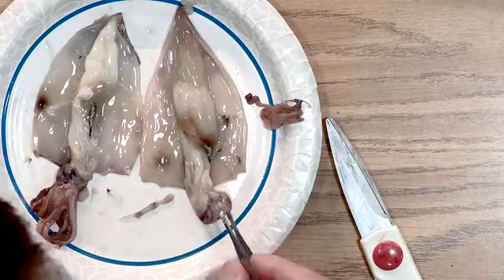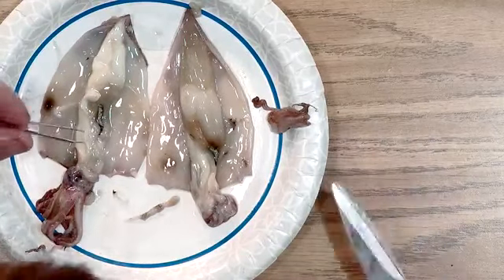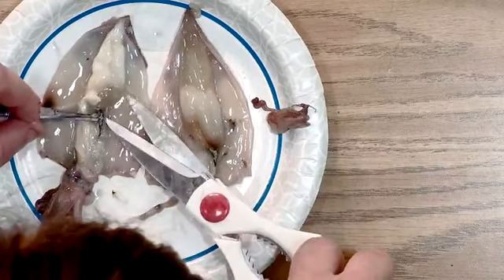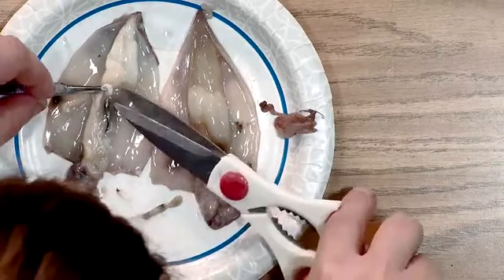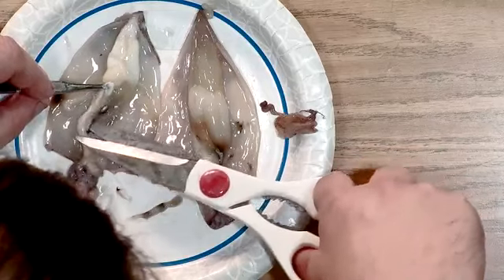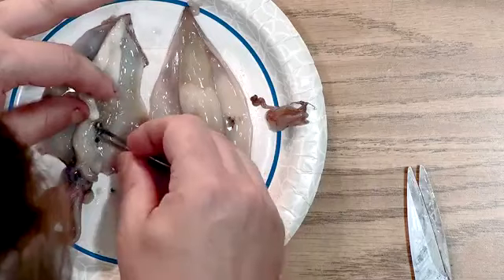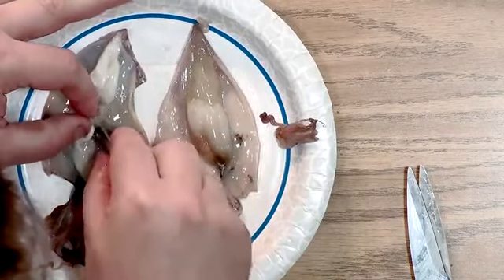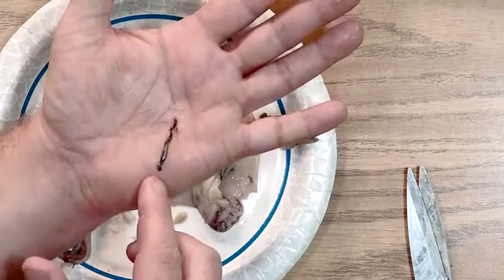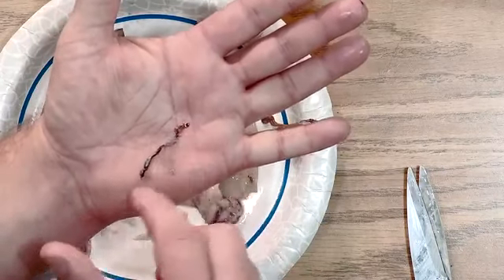All right, so we've kind of looked at that, and I wanted to show you something about these ink sacs. It's pretty cool. Now, if I can get in here and separate this, okay, kind of cut it free. See if I can get it without rupturing it. Come on, buddy. It's almost there. Awesome. All right, so you can see I've got this ink sac in my hand now, and it's kind of like worm looking, and it's pretty long.